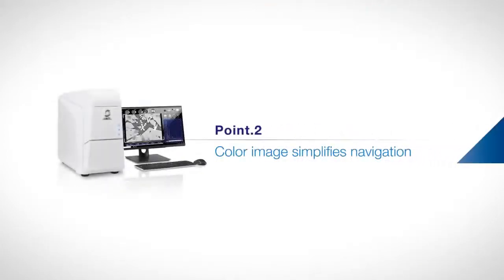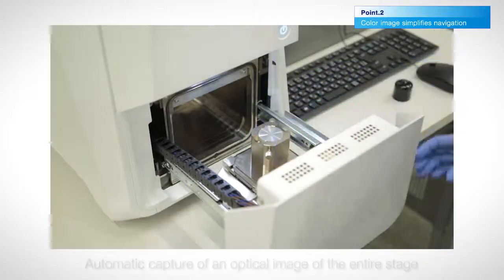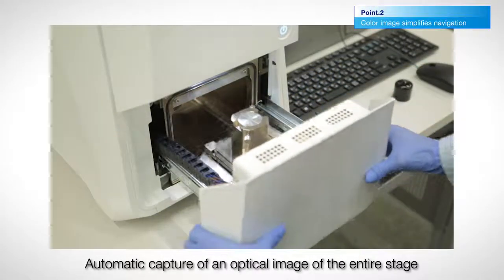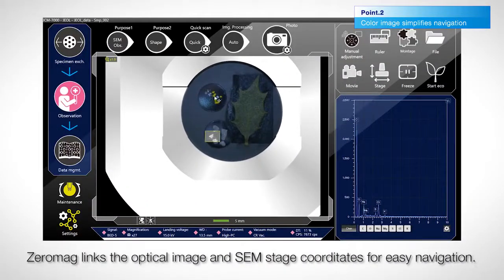The JCM-7000 automatically captures an optical image of the entire stage when a specimen is inserted. This image is used for fast navigation to the area of interest. Our zero mag function links this optical image with the SEM stage coordinates.